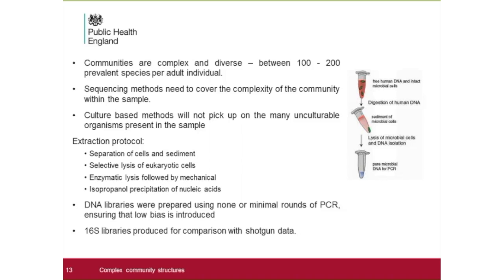But what we have done is we have tried to use a front-end method in order to lyse or reduce the amount of human DNA, digest that out, and sediment the microbial flora, and we used 6 different lysis methods, and they all give us similar or comparable DNA recovery of the microbial flora that are within these samples. And we've used that for both 16S libraries and for shotgun sequencing.